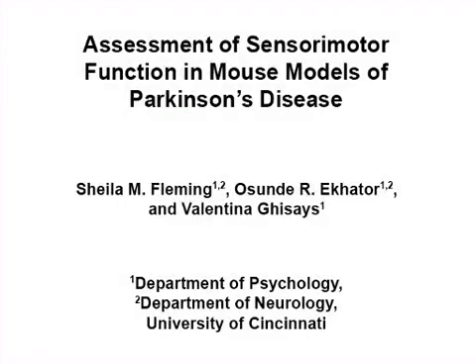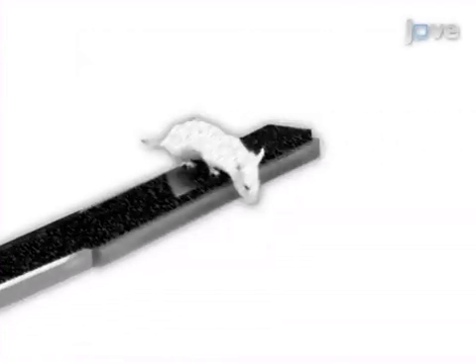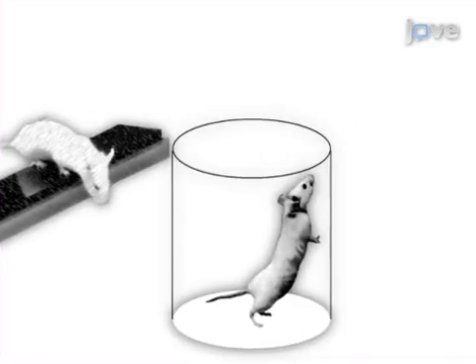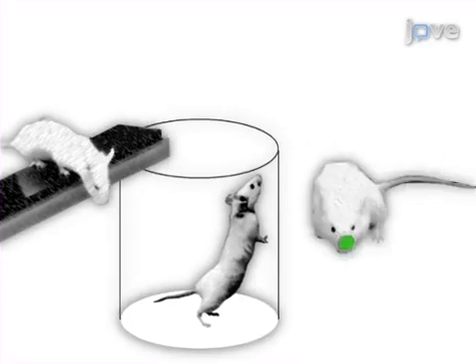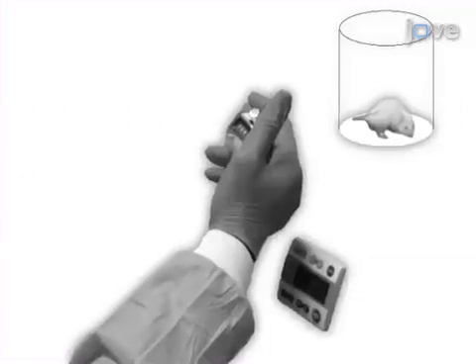The overall aim of these procedures is to quantitatively assess sensorimotor function in mice. We accomplish this by using a battery of sensitive behavioural tests. These include challenging beam traversal, spontaneous activity in the cylinder, and the adhesive removal test, which is also known as the dot test. Following testing, video recordings of beam traversal and spontaneous activity can be scored.